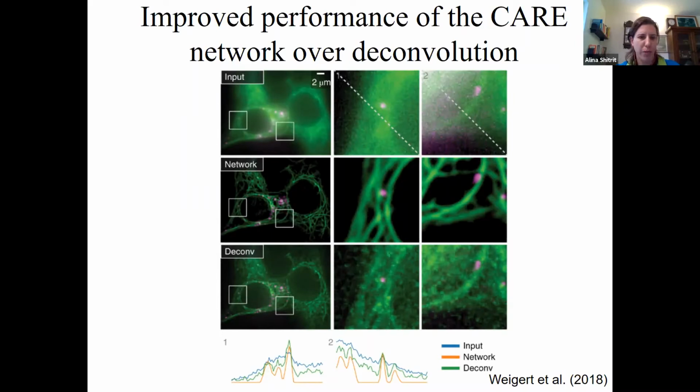One second. The deconvolution is better than the input. You can see that. It's better than the input, but it's much less than the network. Yeah, but that's the whole point of this thing. If it wouldn't be better, then we'd just stay with the deconvolution and this paper wouldn't be published and cited hundreds of times, right? Right. This is exactly, for me, it's new. Yeah, because it's pretty amazing. I agree, it's pretty amazing.